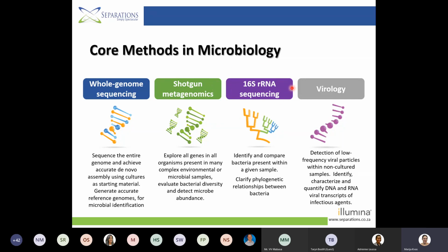And if you look at 16S rRNA metagenomics, specifically the Illumina workflow is based on the V3-V4 region, and that is more suitable for MiSeq, which can do up to 600 cycles. So we will also look into this in more detail next week, but we can also use the same principle of this method to maybe look at different targets, like I mentioned before, maybe ITS or COX.